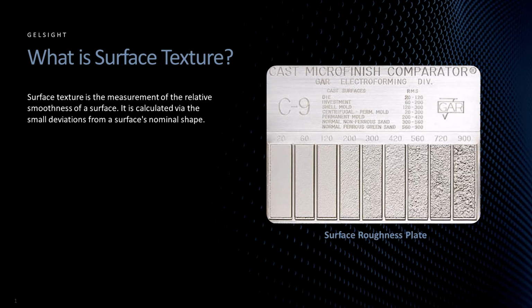The surface texture may have a significant impact on the performance and longevity of components in many engineering applications. For example, a smoother surface texture may be optimal when designing a part that will slide along another part in order to reduce the friction between those two parts.